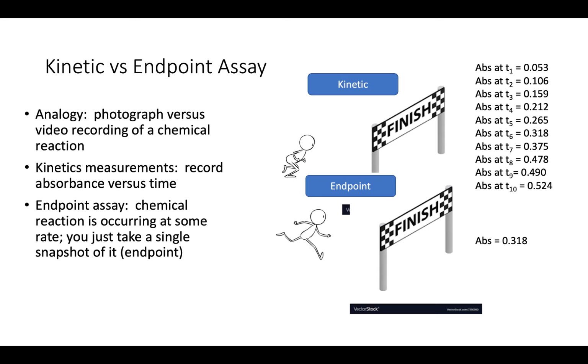Beer's law looks at the relationship of absorbance versus concentration when we did it in Chem 122 and 250. And this time, we're going to be looking at absorbance versus time and looking at the rate of change of absorbance versus time. And you'll see that as we move forward. Again, that time variable indicates that it is a kinetic measurement type assay.